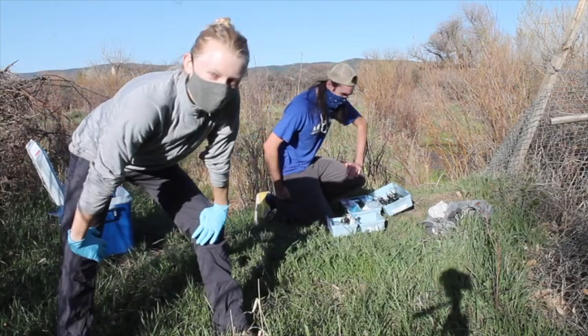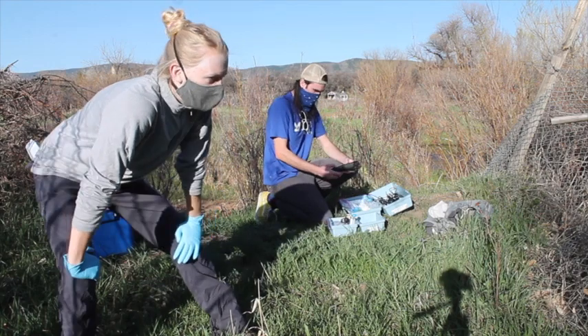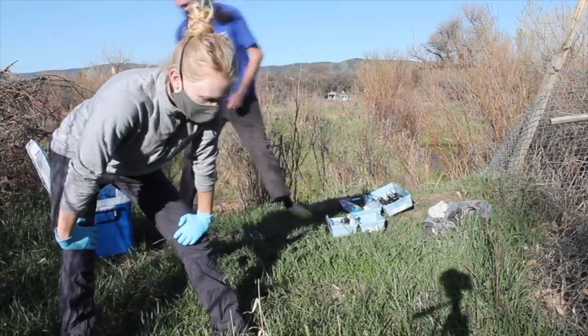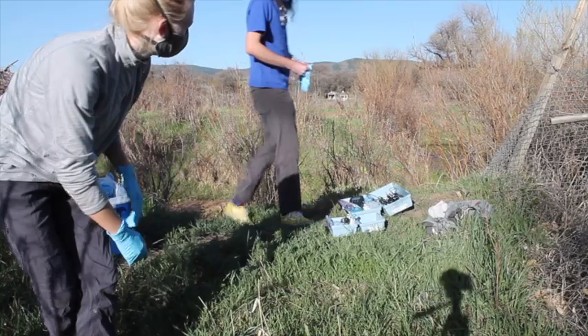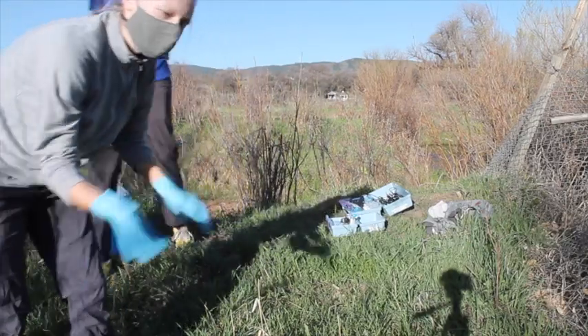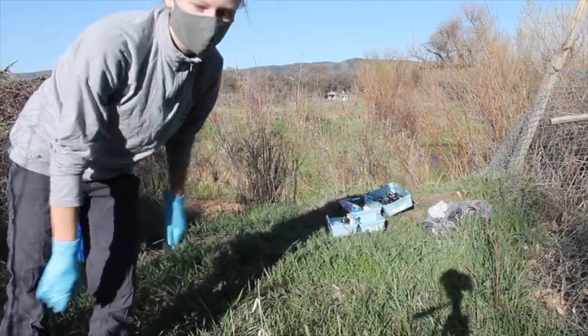Hi guys! So we're at WPC 420, and now that you've seen the panorama, we're going to go ahead and take the samples. I'm going to go grab a big beaker of water and bring it over for Sam to do pH, conductivity, and alkalinity. Meanwhile, I'll go ahead and prep the samples we'll be taking back to the lab.